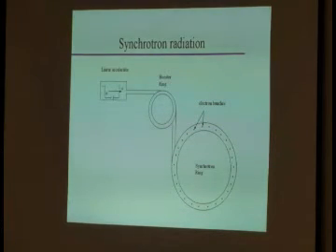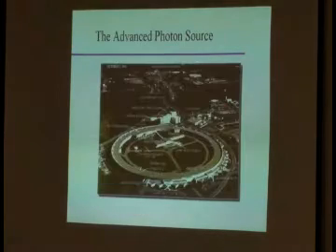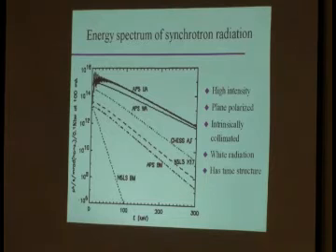You know what the spacing between those bunches is. So you can hit your sample with an X-ray pulse and basically do kinetic studies. What changes at that point in time. So there are a lot of very different experiments that can be done in a synchrotron that you cannot do in-house. And that's why we have these facilities, and they are actually very popular.